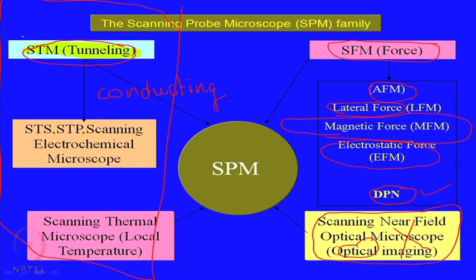We will talk only a little bit about the STM, very fundamental basics of STM, and then we will move on to the AFM. As I have already pointed out, I will try to give you a perspective so that you understand the operational aspects of an AFM along with the physics and the key components.